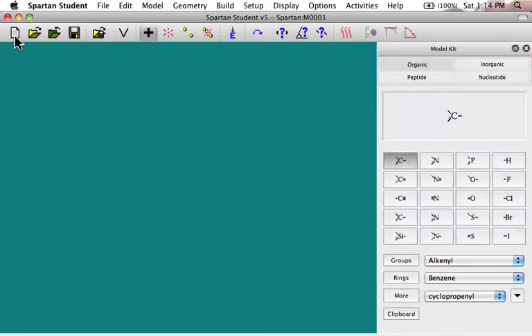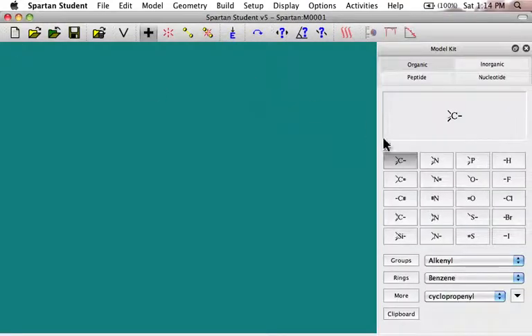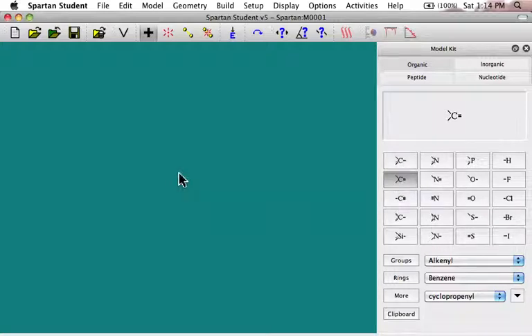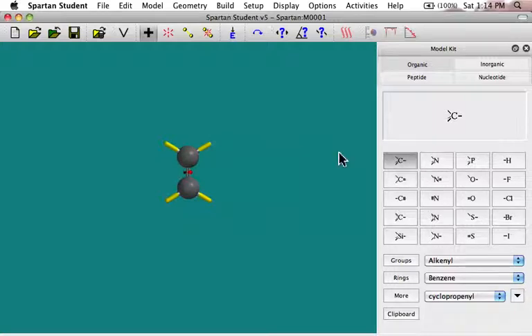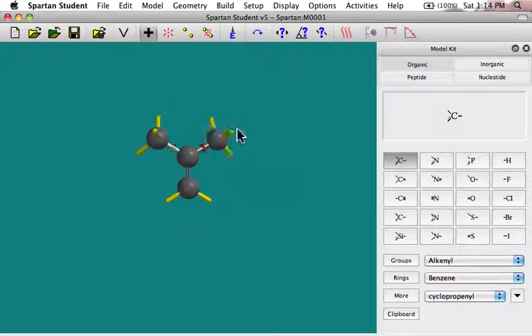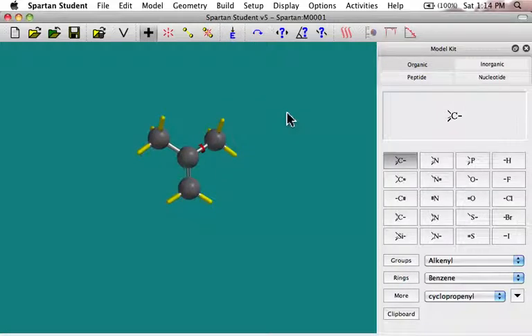So let's build some molecules. I'm going to do a couple of C4H8 isomers, and that has one degree of unsaturation, so I'll start with an alkene. Let's put two methyl groups on the same carbon, hit my little energy minimize, and there's one of my isomers.